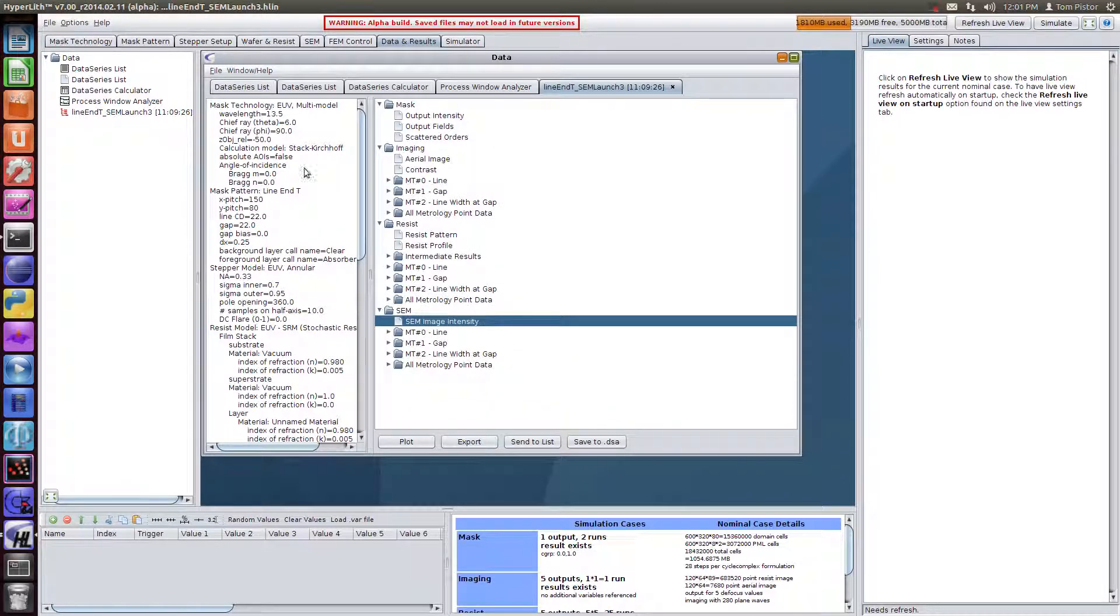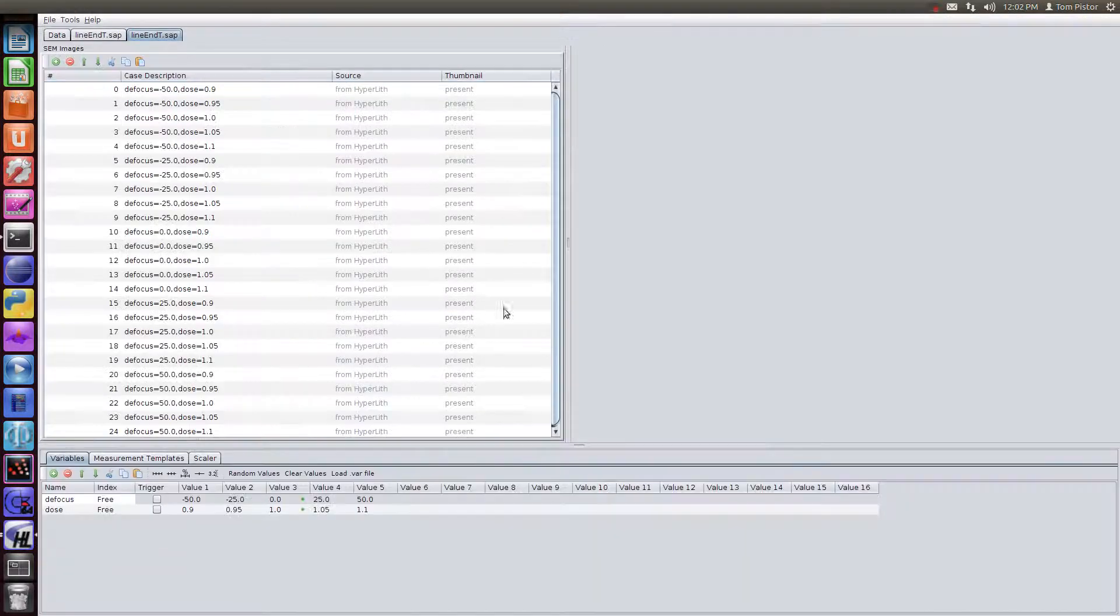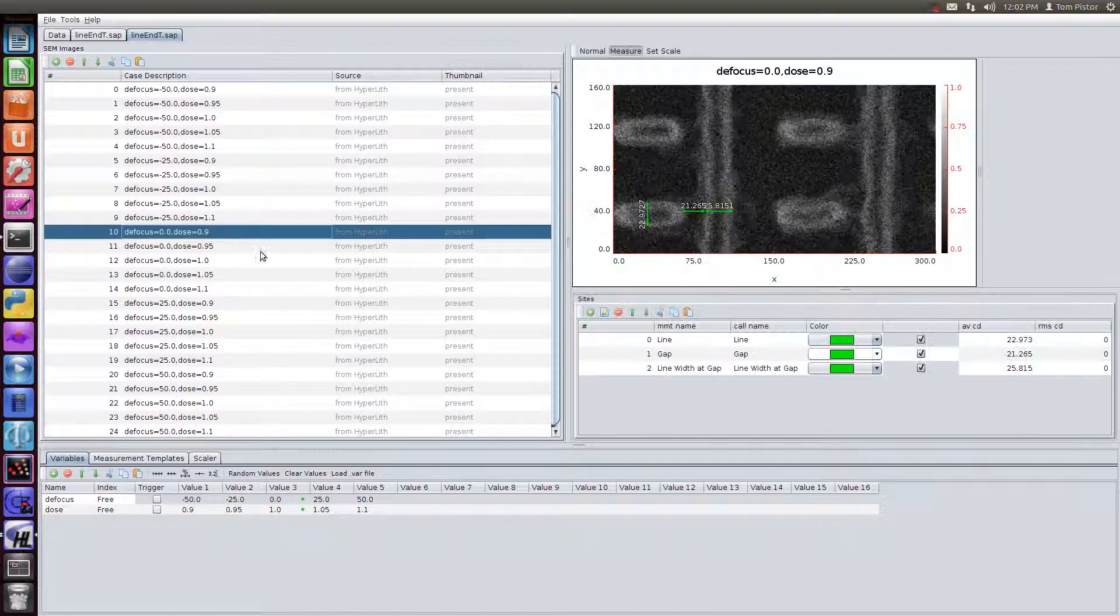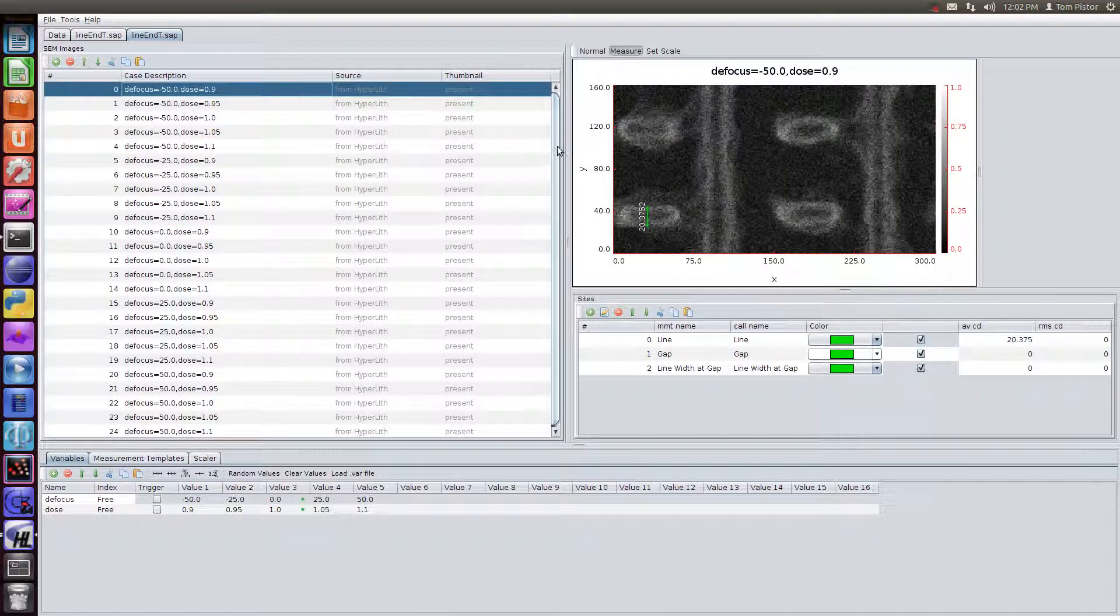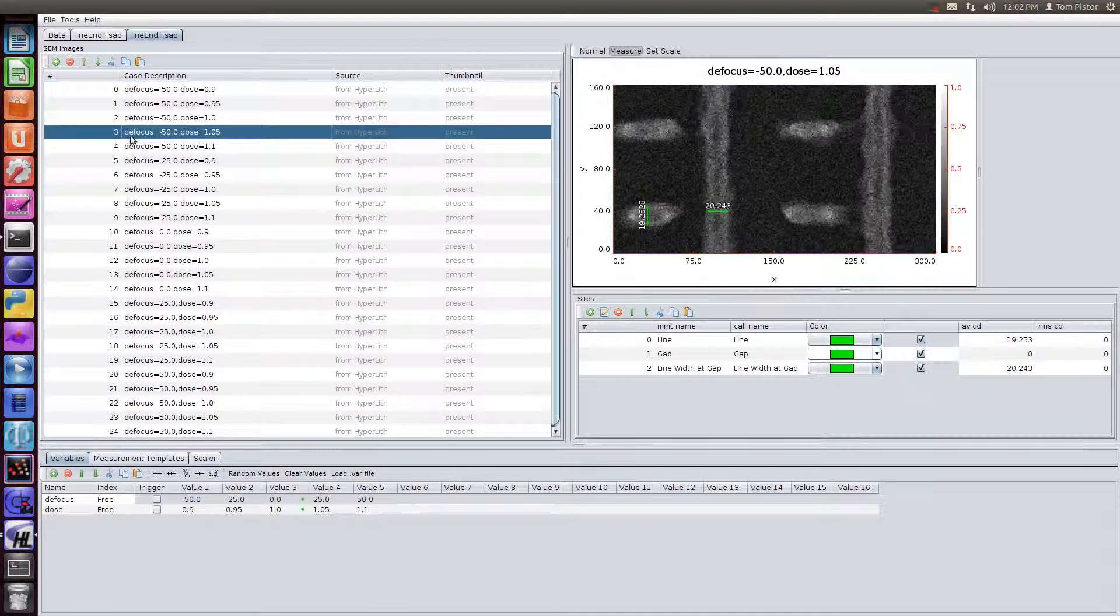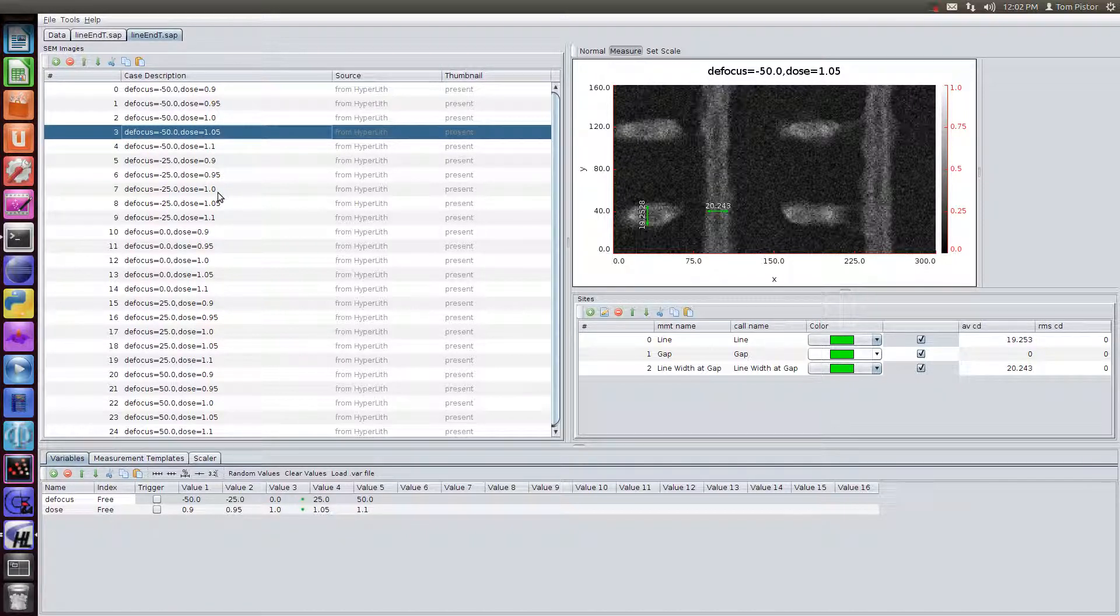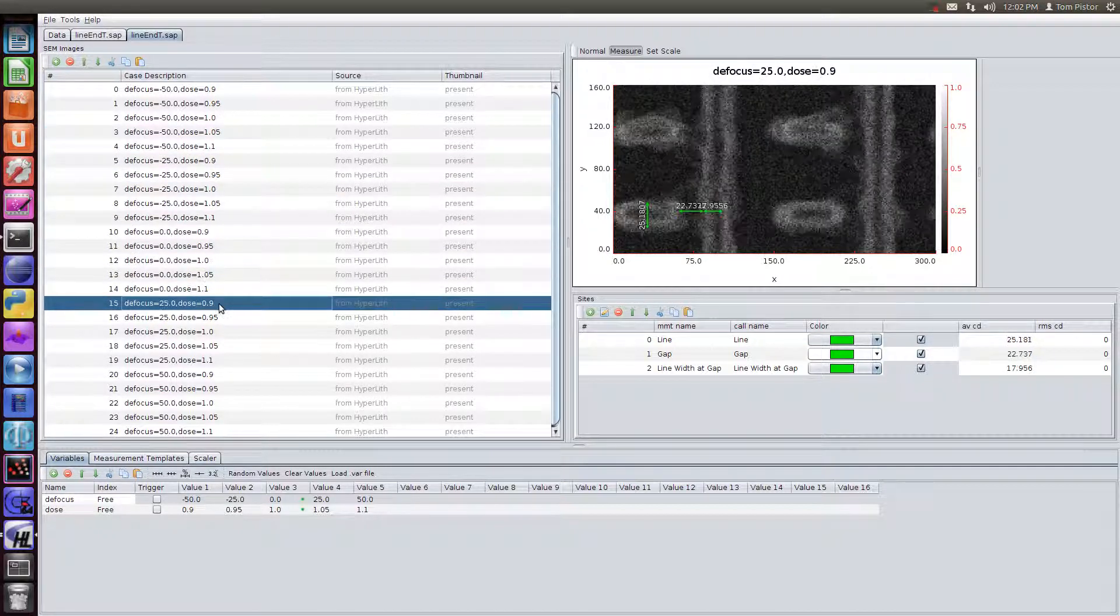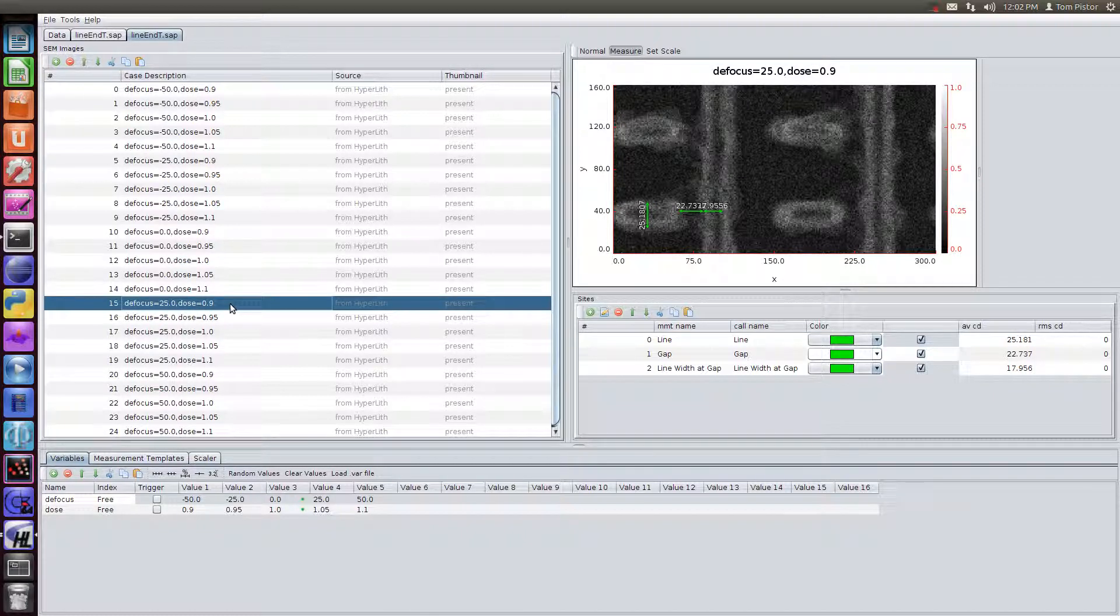And the output of this is the output tree, which has the resist profiles, the aerial images, and the SEM images. And it also has CD of the SEM images being done at these locations. Now, this is just this basic, simple measurement being done at these three sites. And to really do a proper analysis, it's a little bit more than we can handle in Hyperlith. So we're going to use the SEM image analyzer, Pan SIA, to do this. So we'll send this to the SEM analyzer. And so these images, it's asking us to save first. And so now these images come into the SEM analyzer.